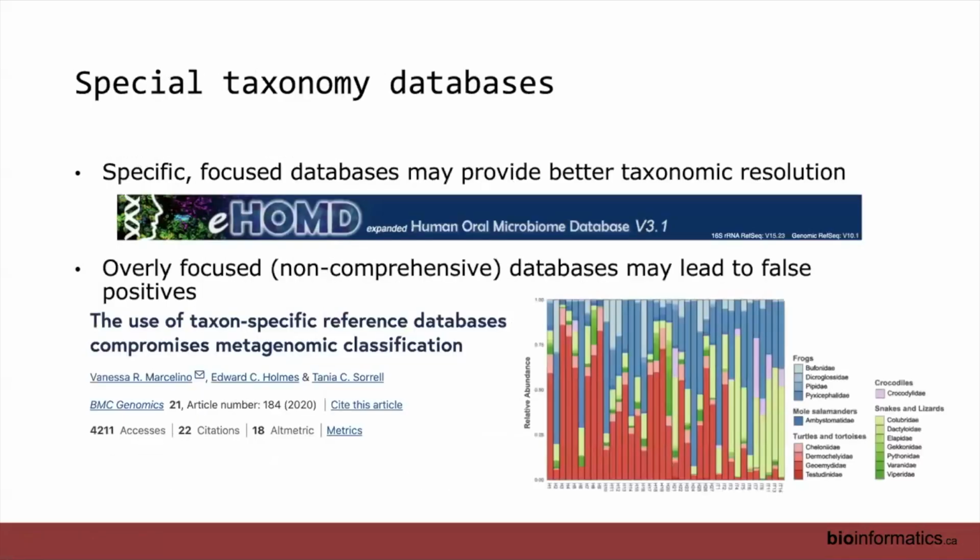There are also many, many other databases. So for some specific applications, there may be different databases that are recommended. There is a human oral microbiome database. In our investigations of saliva sequencing, we found that this usually gives better species level classifications than one of the bigger databases. It's much reduced, only about 1,000 taxa in there. But if you've got a relatively well characterized system like the mouth of people, then we've probably characterized most of the taxa that are there.